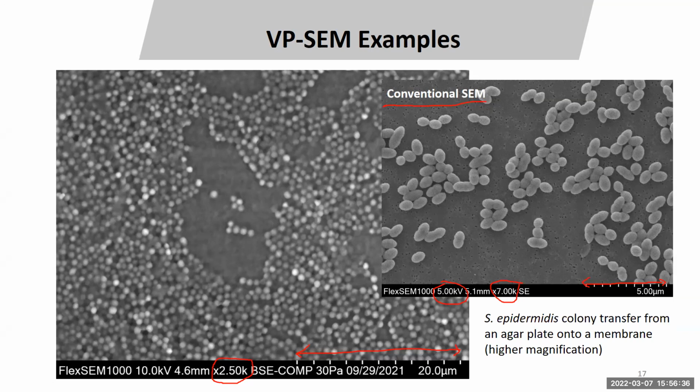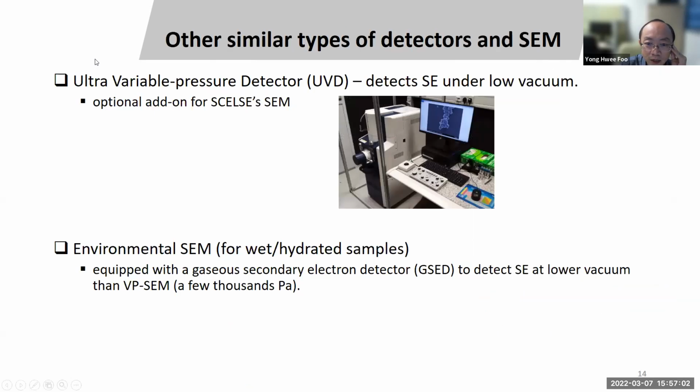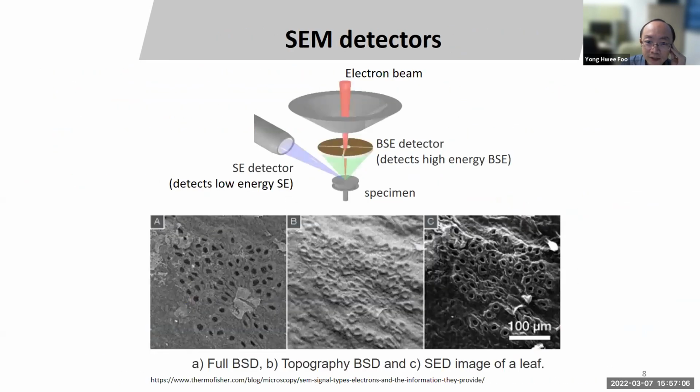In regular microscopy, we section the tissue and then place it directly on the microscopy slide. In this case, if we have a small tissue section, where can we place it? Is it a specific slide? How does it work exactly? Because the mounting on SEM is quite small. We only have about a 2.5 centimeter mount here.